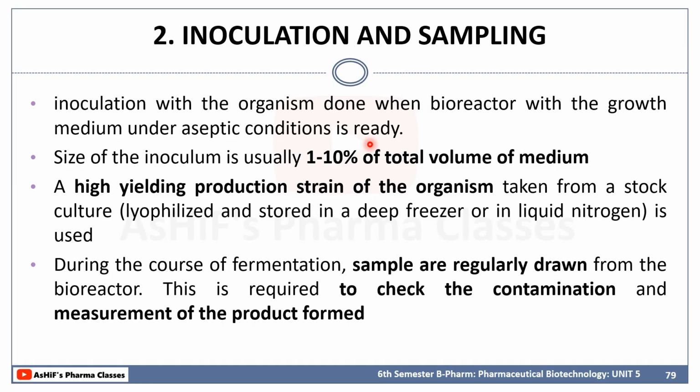Okay, now how many ml will we inoculate? So we have to take almost 1 to 10% of the total volume of the media. Suppose you are going to take 1000 ml of the culture media, we will take 100 ml of the inoculum. That is what the 1 to 10% means.